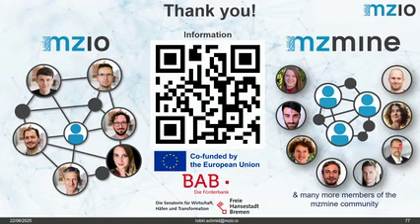If you want to use it in other tools that need the conversion... There might be a new format on the horizon, but it's very far away. With mznext, get involved if you're interested in that. Propose what you want to do with data, and maybe it's going to be better for IMS data. With ion mobility, there's so much data, and the format from Bruker is actually quite good. They are very open with their SDKs, so you can very easily implement it.